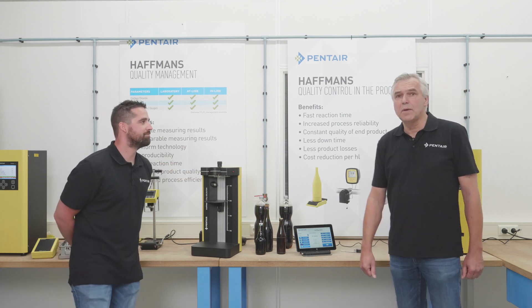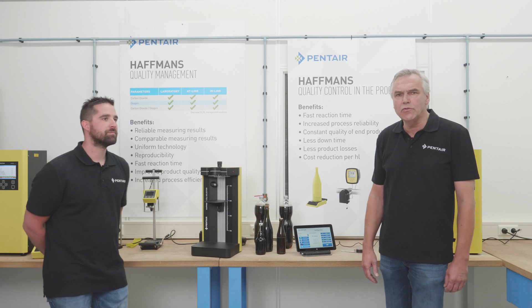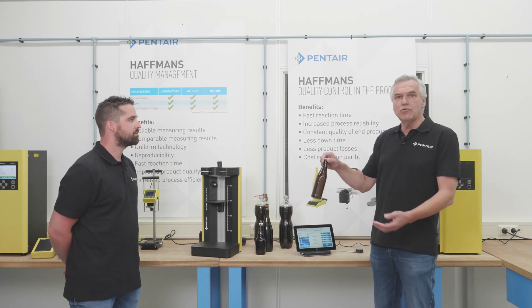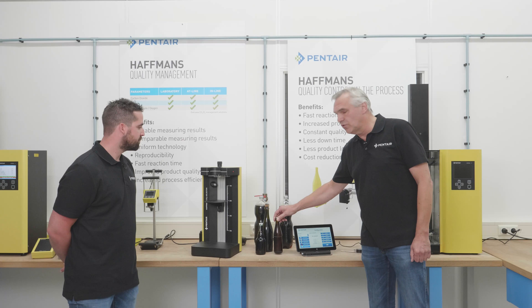Yes, of course, I'm happy to be here. Thank you for your introduction, Randy. The CO2 selector is an instrument for measuring CO2 non-destructively. Non-destructively means your package goes into the instrument and you can measure it over and over again without destroying the package. So it doesn't have any influence on the package.